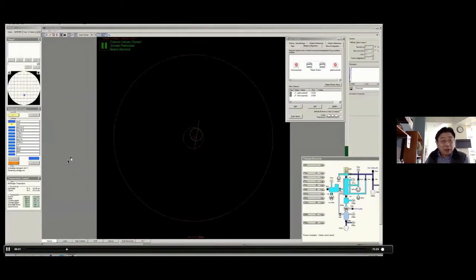But here is a break, because you see when we change specimen, there's about 5 minutes for every specimen change. So that basically means this is the time you cannot do anything. You don't want to walk away because you can see there's a lot of things going on in this status.